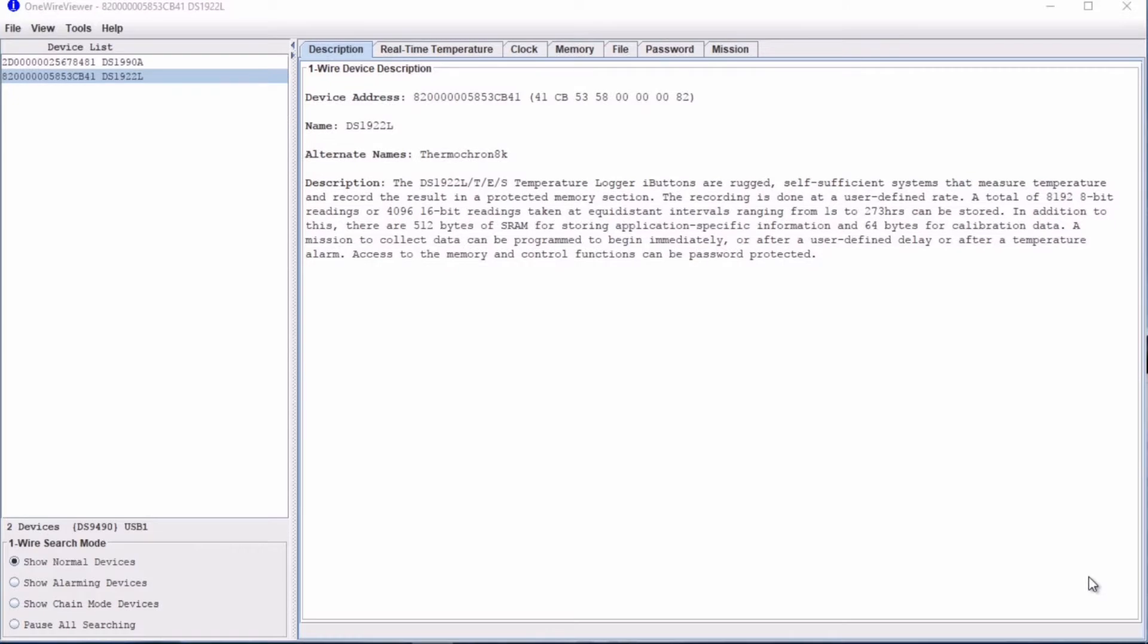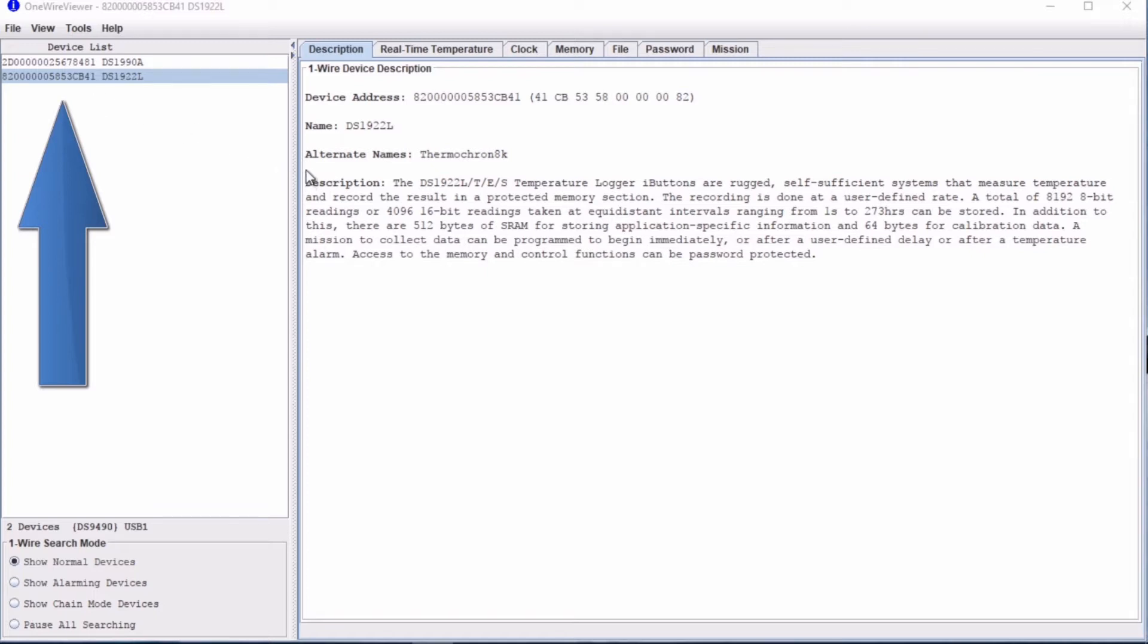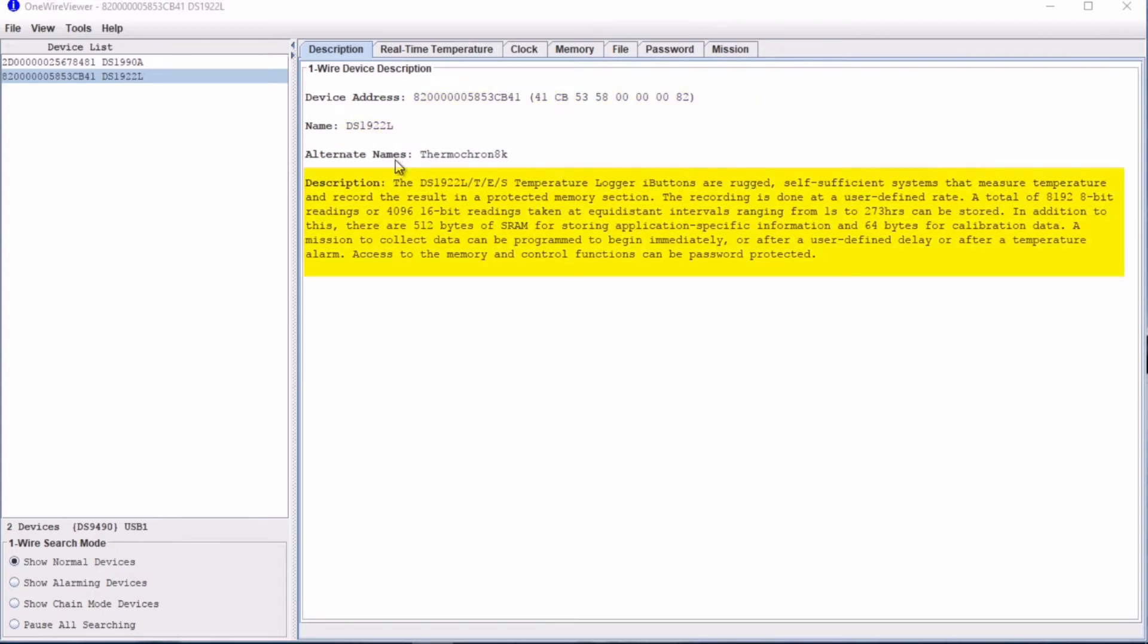Here we can see the software has picked up the DS1922L. There are various different tabs we can use to control the device. This is the Description tab. It gives the name, address and a short description of the device.